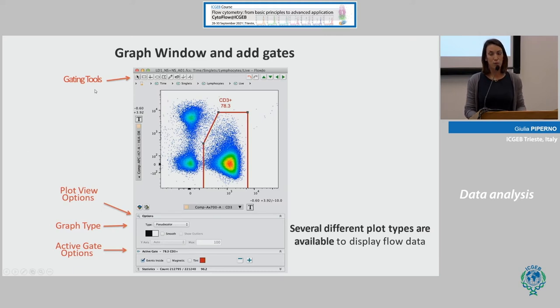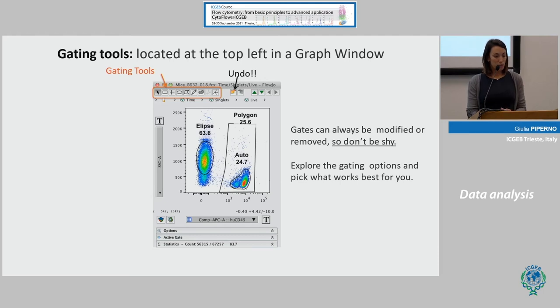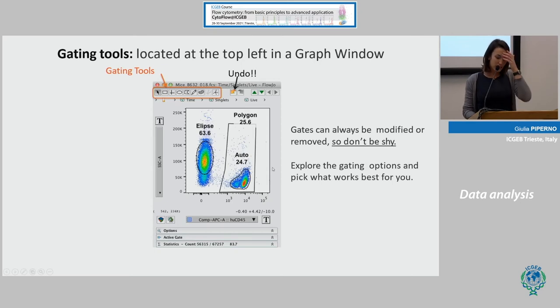In the upper part of this window you have the gating tools — how to create gates — the plot view options, the graph type, and active options. There are several types of plots you can create in FlowJo, ranging from pseudo-color contour and density to histogram. Try them and find the one that best represents your data. The gating tools allow you to choose rectangle, ellipse, polygon, or auto. Auto means the software automatically recognizes the most dense population. You can also undo, so please try and modify your gates — don't be shy. Explore the gating options and find the best one that represents your data.